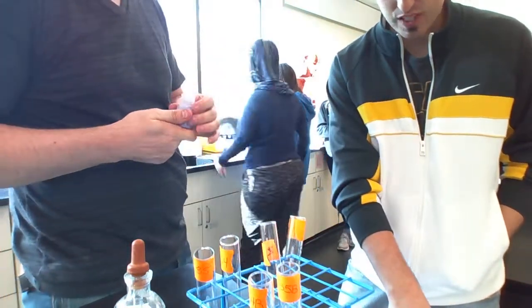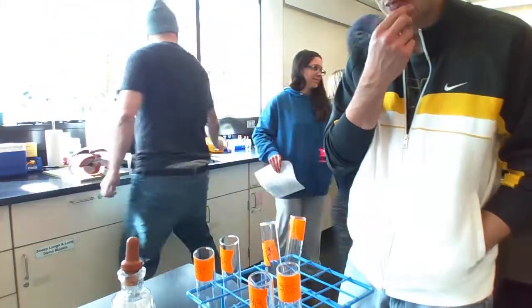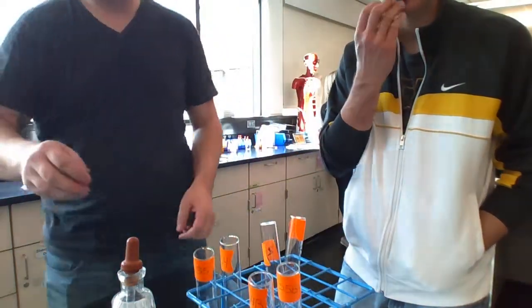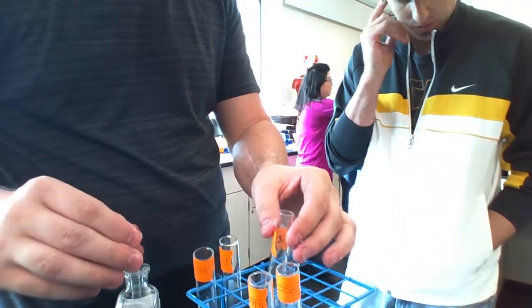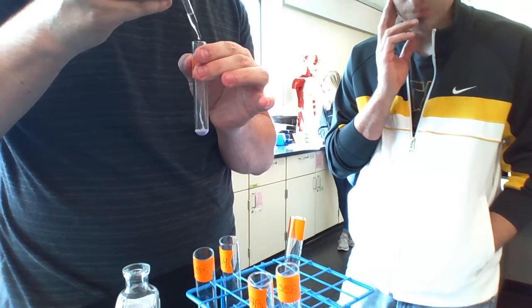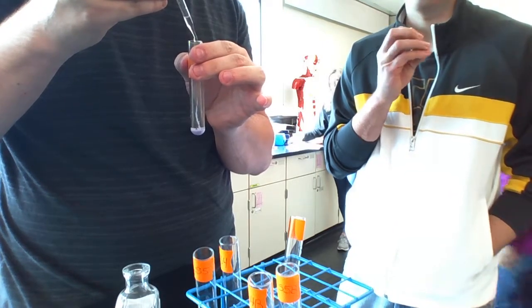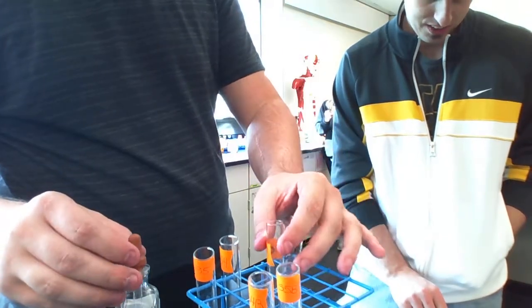And then we'll do 5 drops of water on tube 2. This is actually different. This is the last tube that we don't have. So right now, you guys are just working on the chart. Yes.